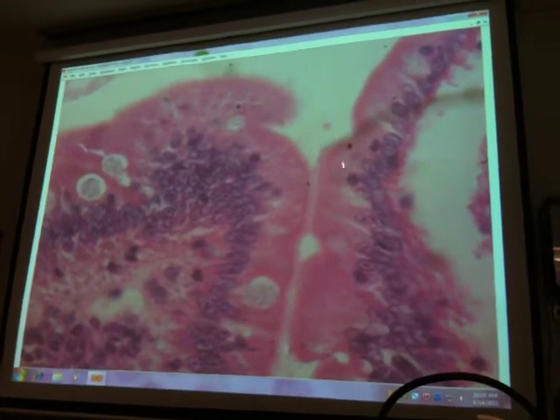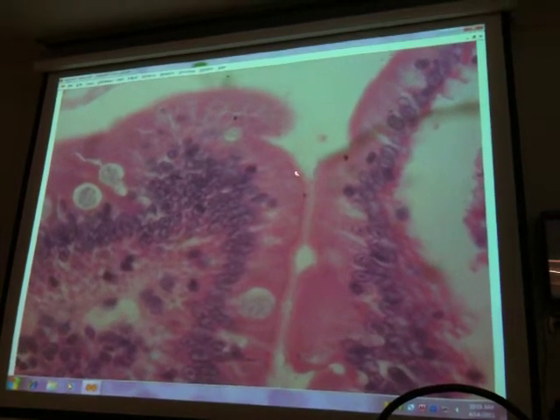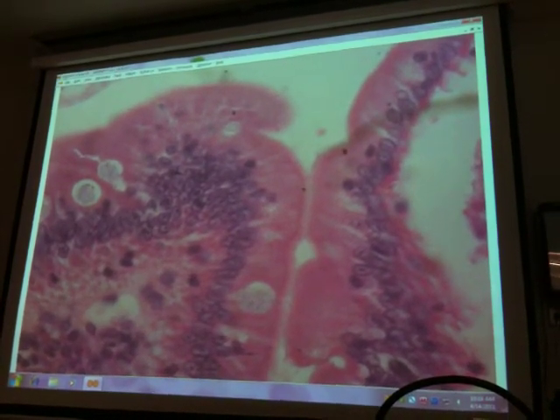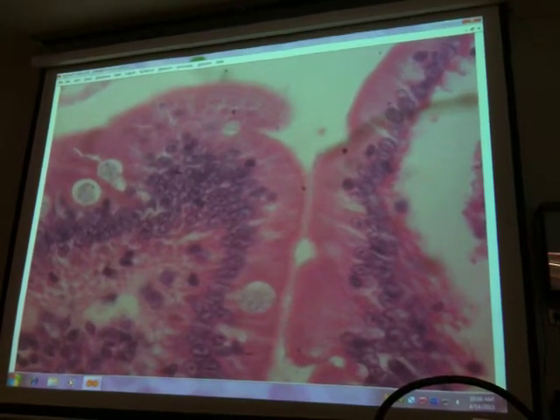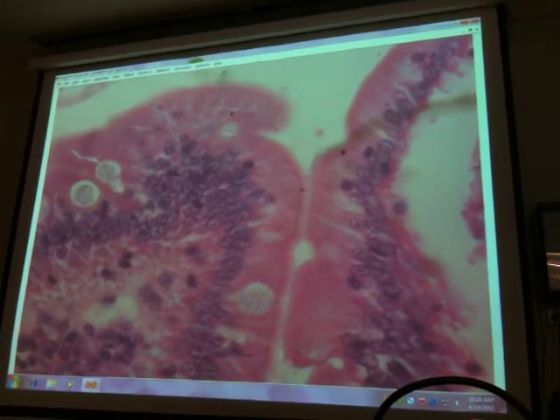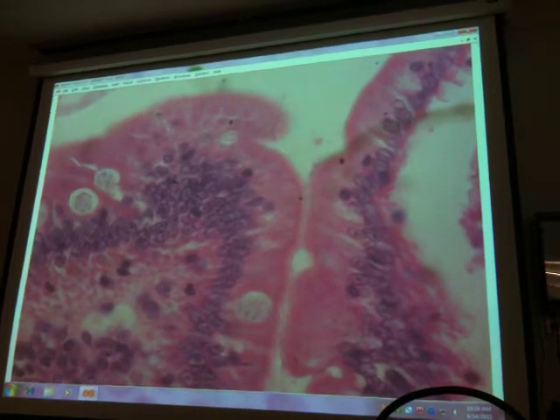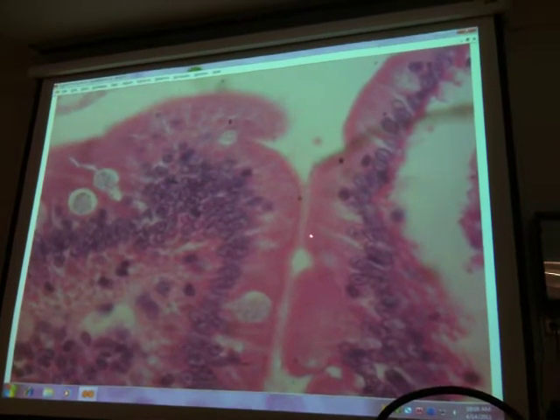Simple columnar epithelium with microvilli. This is a brush border of really tiny, really abundant microvilli. There might be 600 microvilli on the surface of every cell. Okay? And then the cells go up and over villi. So we're just seeing this smear here. That's not a mucus smear.